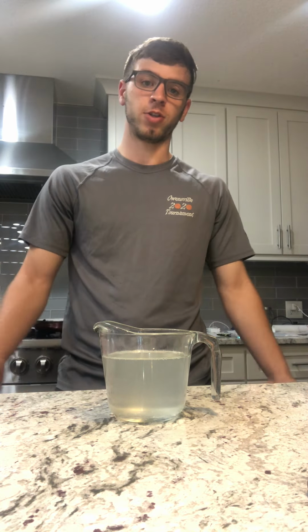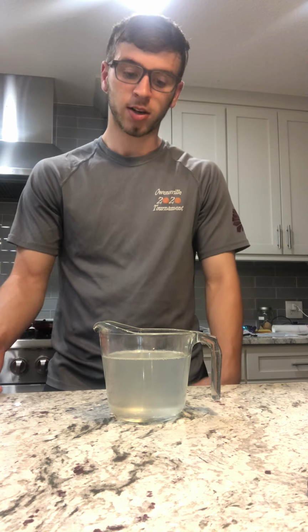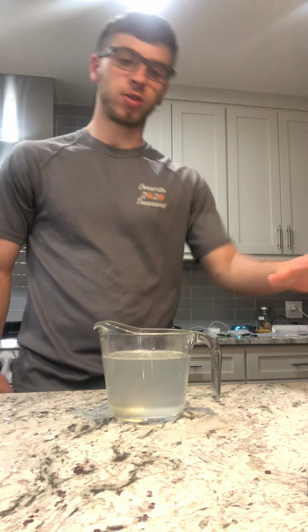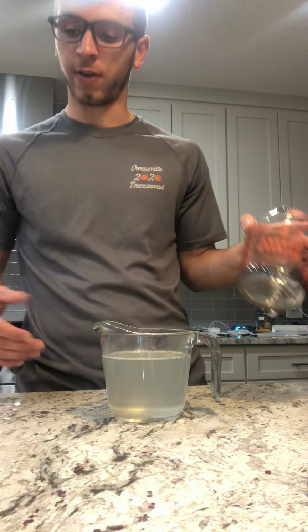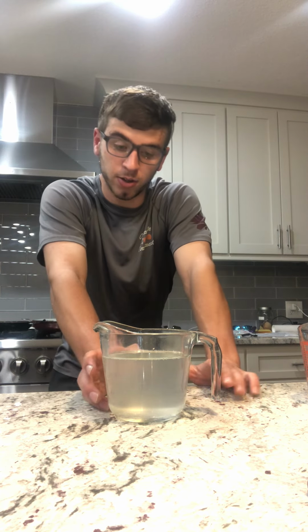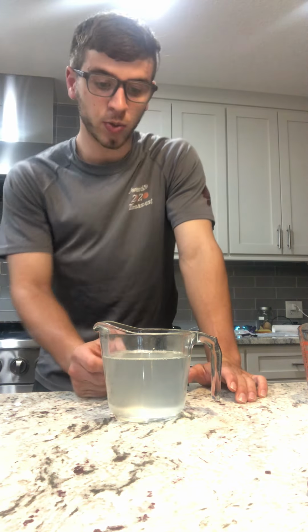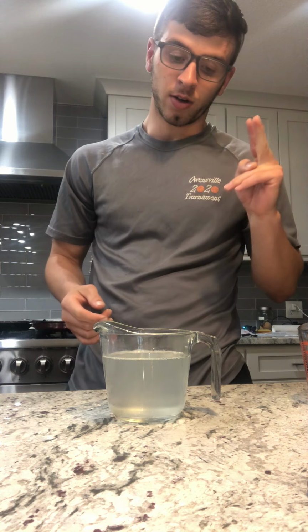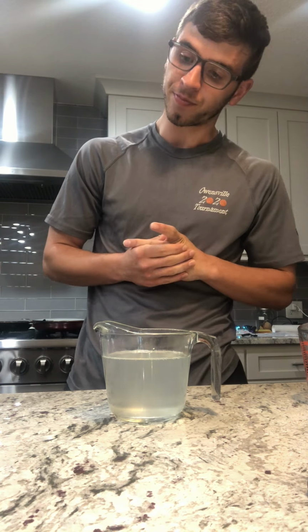While we're waiting for the reaction to occur, I'm going to go ahead and talk about it for a little bit. So what's happening is in solution A, we had the vitamin C and the colorless I- ions. And then in solution B, we had the hydrogen peroxide and the cornstarch. When I pour these two solutions together and mix them, they start to react with each other. But interestingly, it is not just one reaction that's occurring. There are two reactions occurring right now.